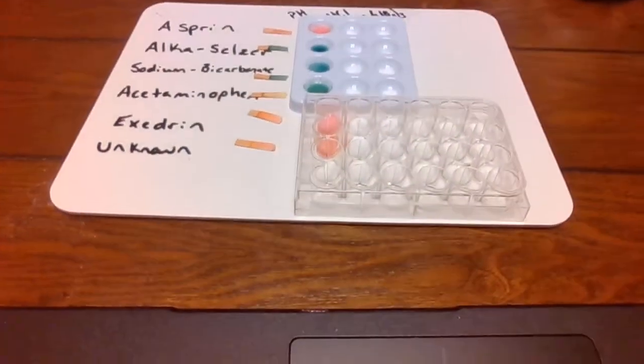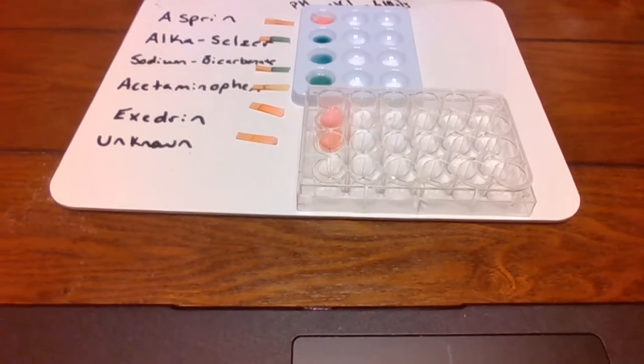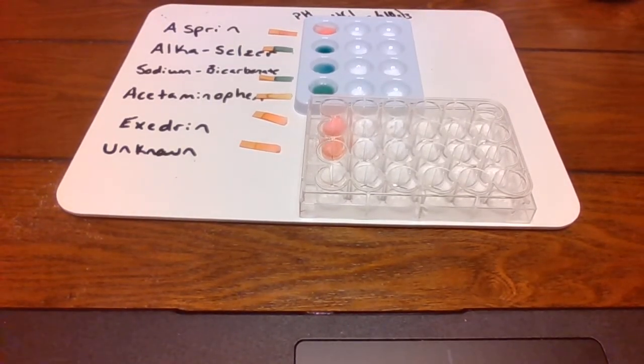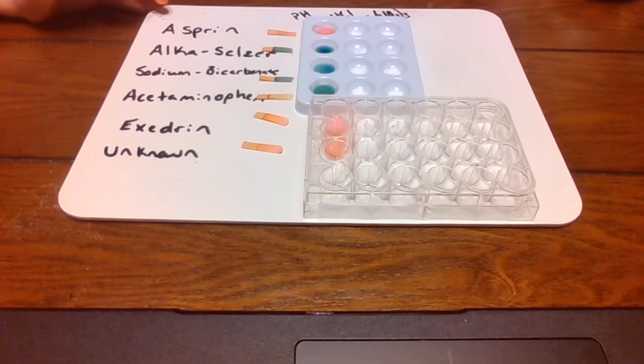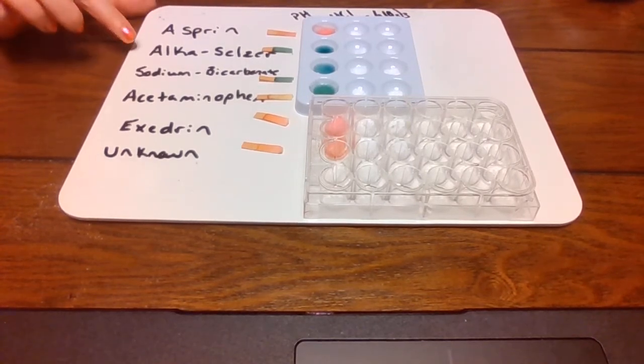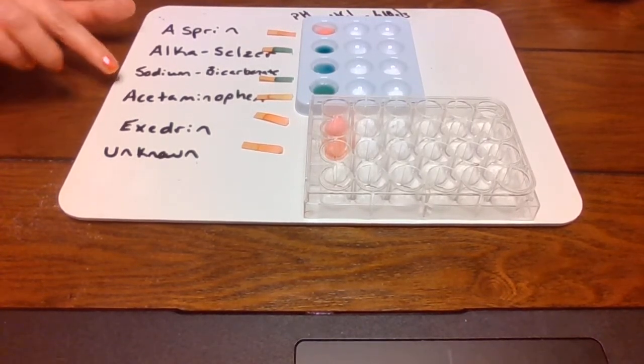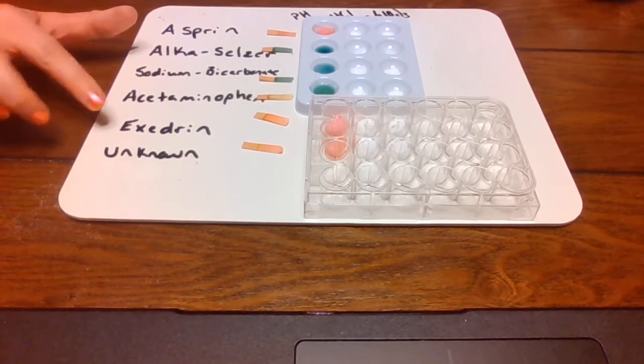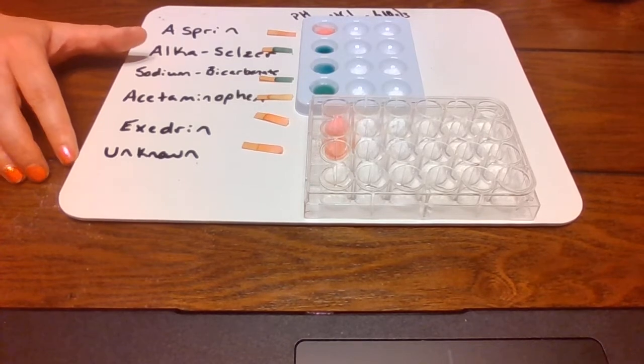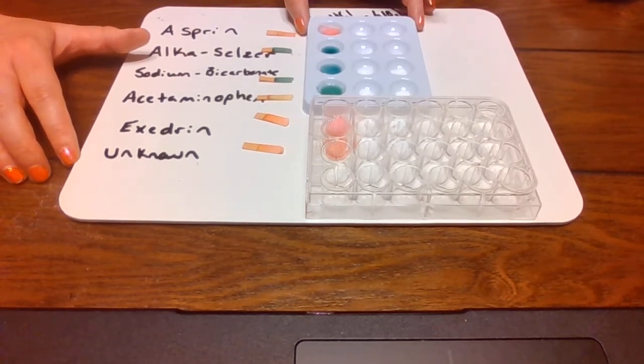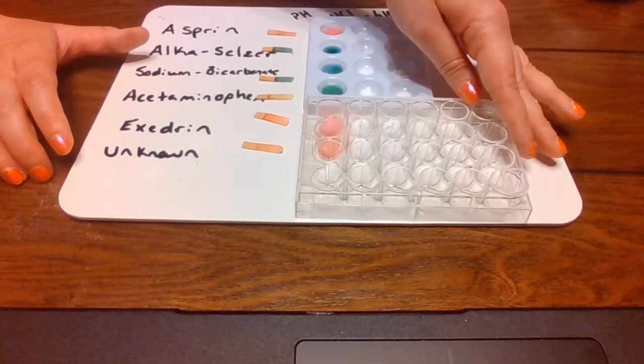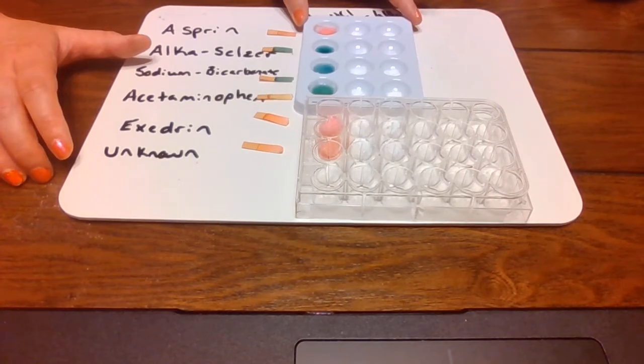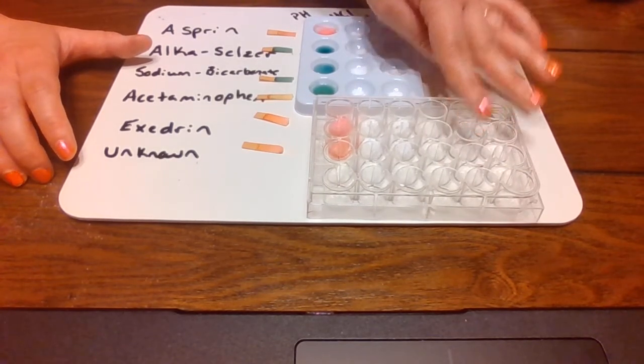So now I'm gonna move our video down and you can see right here is what I was talking about. Our little dishes that we have made, we have aspirin, Alka-Seltzer, sodium bicarbonate, which is basically baking soda but they put it in heartburn medication, acetaminophen, Excedrin, and then we have an unknown. So this unknown you'll hopefully figure out by the end of it to answer your lab questions. That would be the goal is to figure out the unknown.